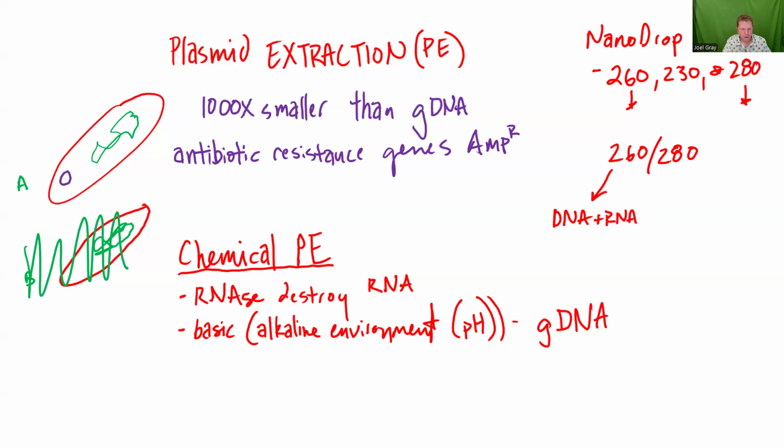For DNA/RNA, the measurement is independent of the composition of the molecule. So that doesn't matter. Basically what that says is it could be nothing but A's. It could be nothing but T's. It could be a 100% AT content molecule. It does not matter. The sequence is not going to influence this.